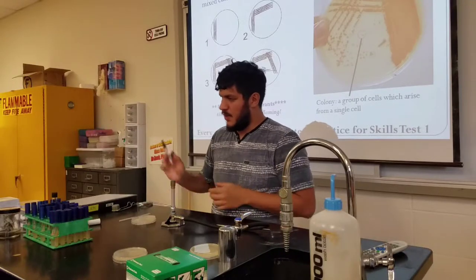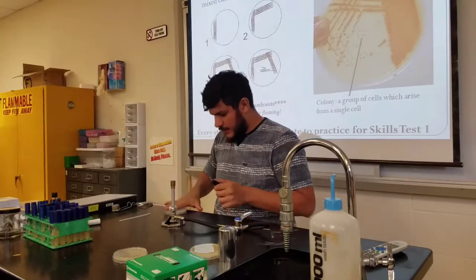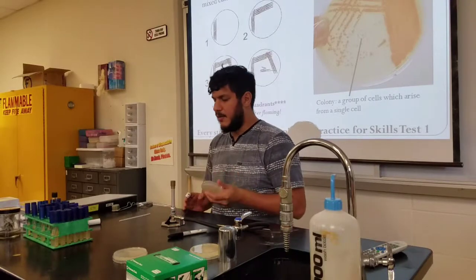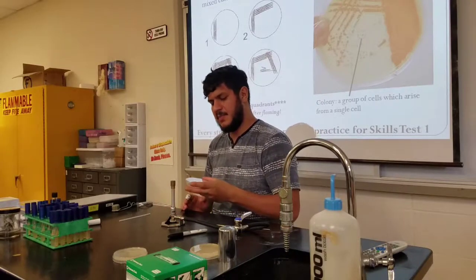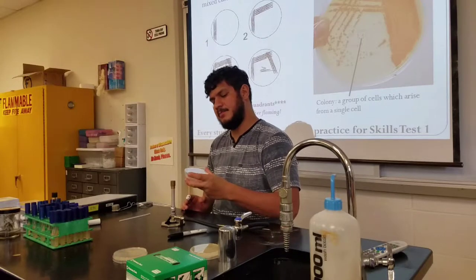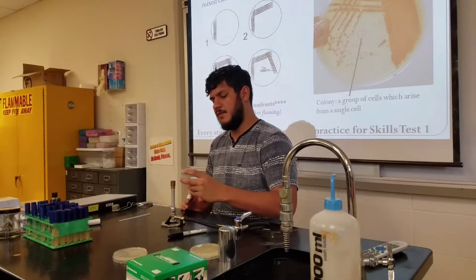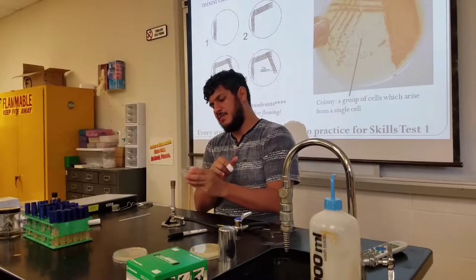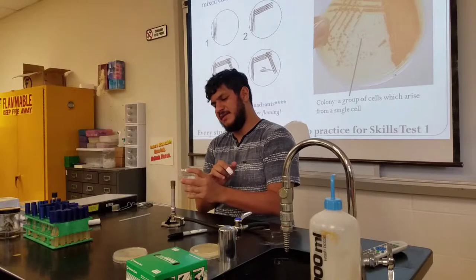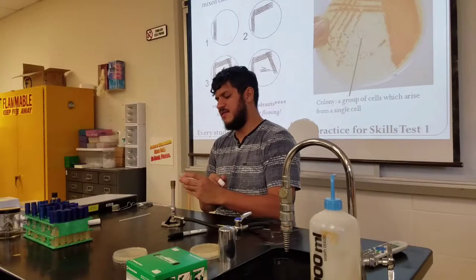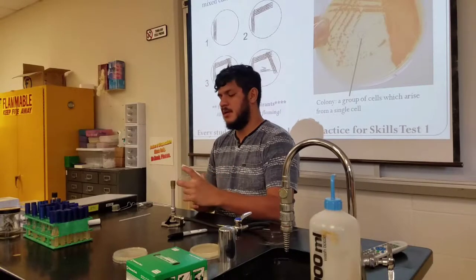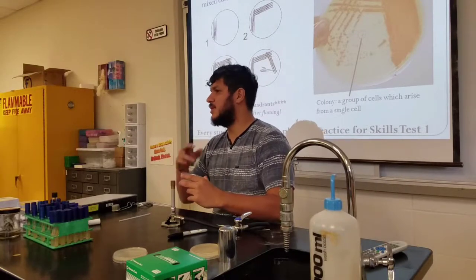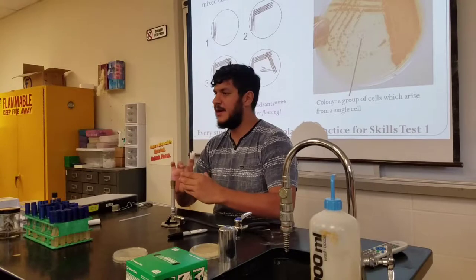A proper way to pick up a plate is to slide it all the way to the edge, grab it with your hands, and you're going to do a chopstick motion — holding it with your thumb in place and using your index finger as leverage to open the plate inside the aseptic zone, which is the only place this plate should be opened.